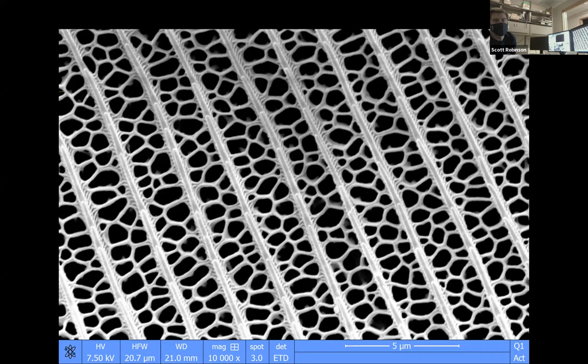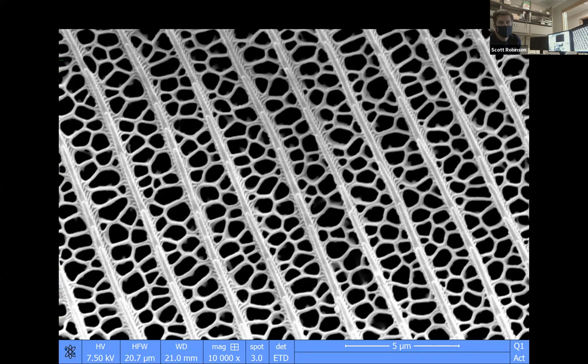It's kind of like when you get one of those lenticular postcards, and you turn the postcard and you get different images on it. The little wing scales are much like that. Because of the way that they're built, with those little lines in them, they interfere with the wavelengths of light and create different colors. Sometimes they're called structural colors instead of just regular pigmented colors.